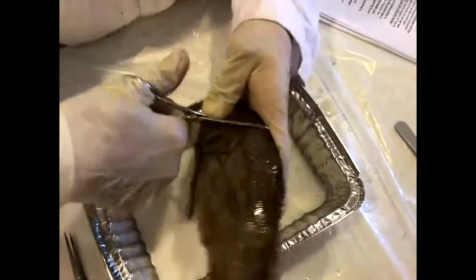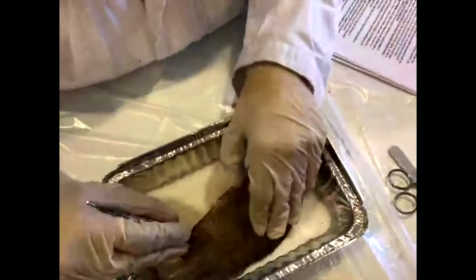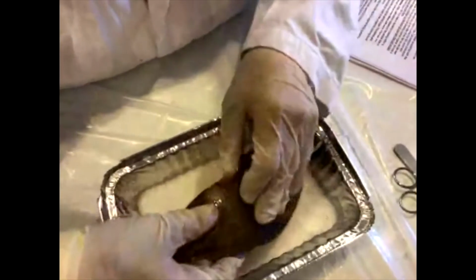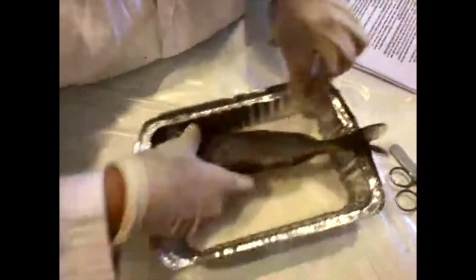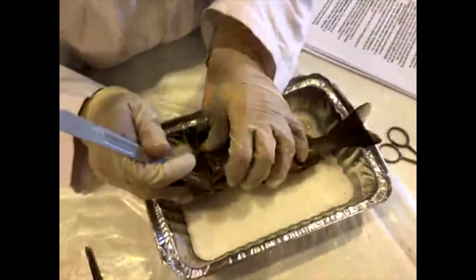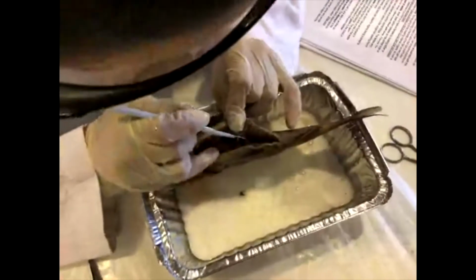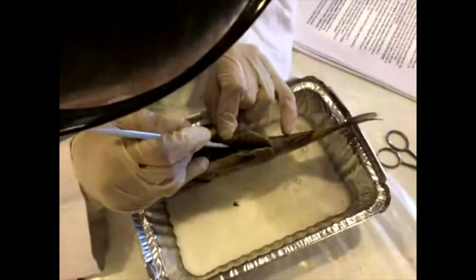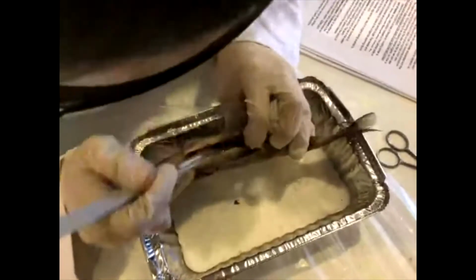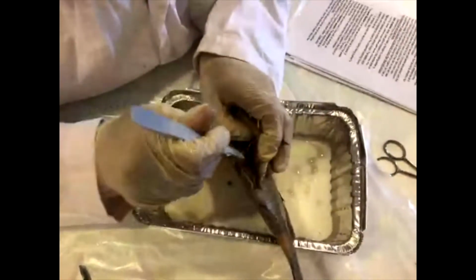Just gonna get through here. Brain. Yep, they do have a brain. We're probably not going to see the brain today. It's quite small in a fish, and it's actually pretty hard to find in there. So now I'm going to lift this flap a little bit. And I'm going to try and gently lift it without pulling too much. This might not be a good camera angle, but just give me 1 second.